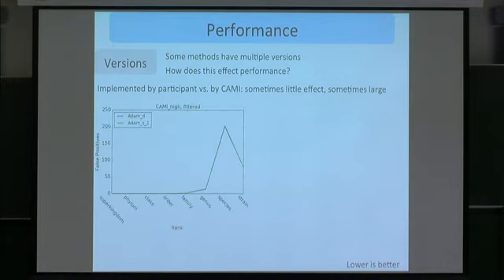Sometimes little effect, no difference between those two for false positives across taxonomic ranks. High complexity sample. Right here, notice this one says just CAMI high. This is the pooled one, so all 5 were thrown together in one big file and then profiled.